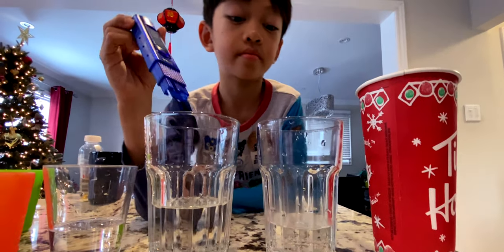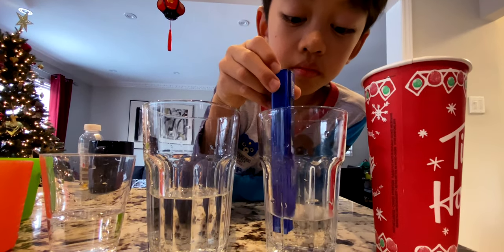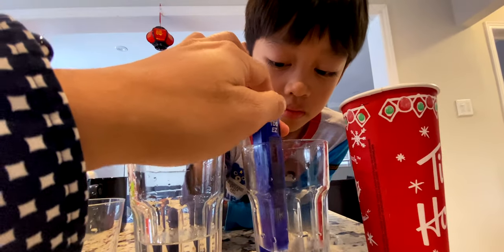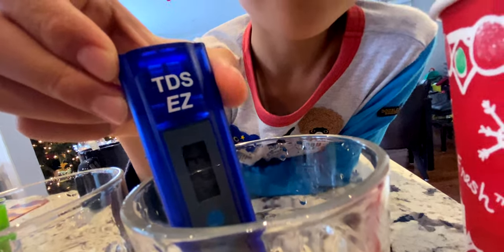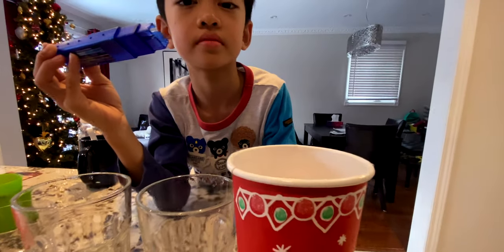Now go to the hot water tank water. Let's see. What is it at? 222. 222.